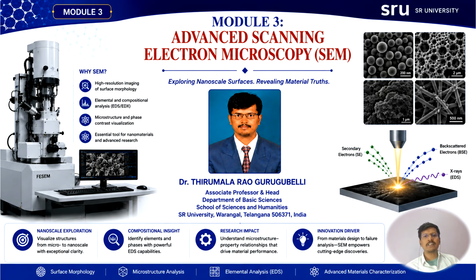The third advantage is that SEM helps to study the microstructure and shape control. Researchers working on nanoparticles, nanorods, nanotubes, thin films, and composites frequently use SEM to evaluate the morphology and to optimize the synthesis conditions.